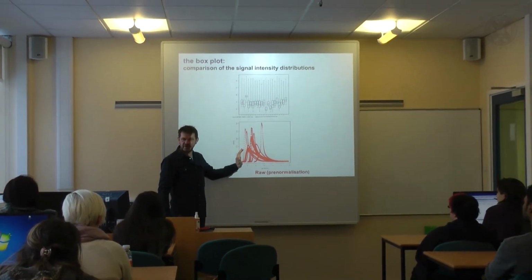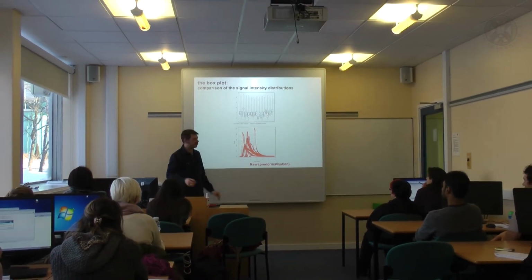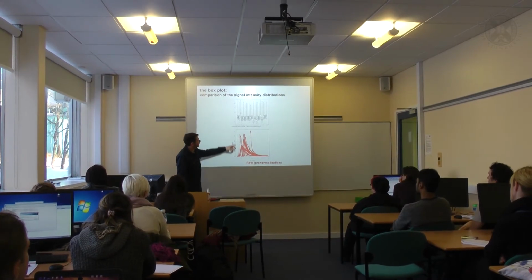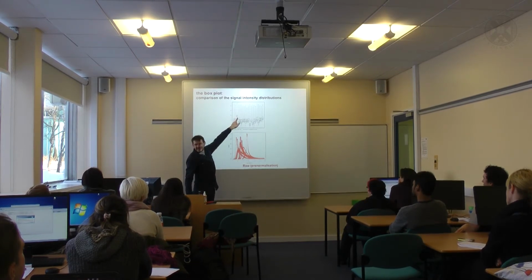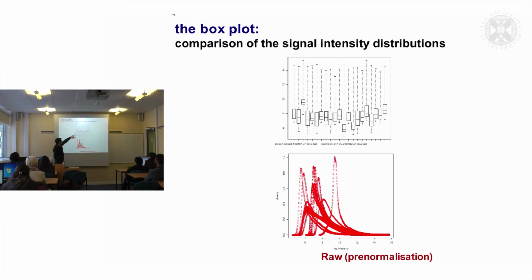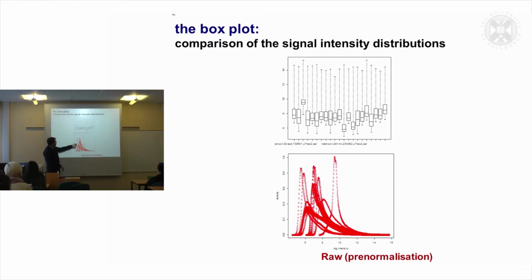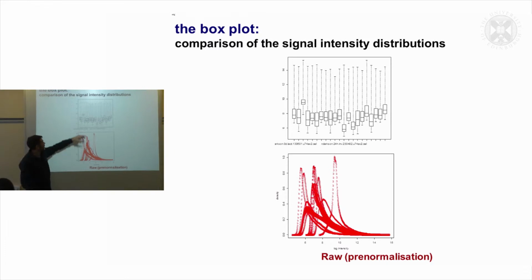You have a lot of data at the low end, i.e. genes which are not expressed or expressed at a very low level, and then you have a further distribution of things which are expressed at a higher level. Now, quite often this is a bad idea, but that guy here is clearly an outlier. So a box plot really is a way of presenting that histogram or curve as a box. So that's the 50th percentile, where your average expression, if you like, 25th and 75th percentile, and that's the whiskers shown there. So that shows a big tail of the last 25% of your data.